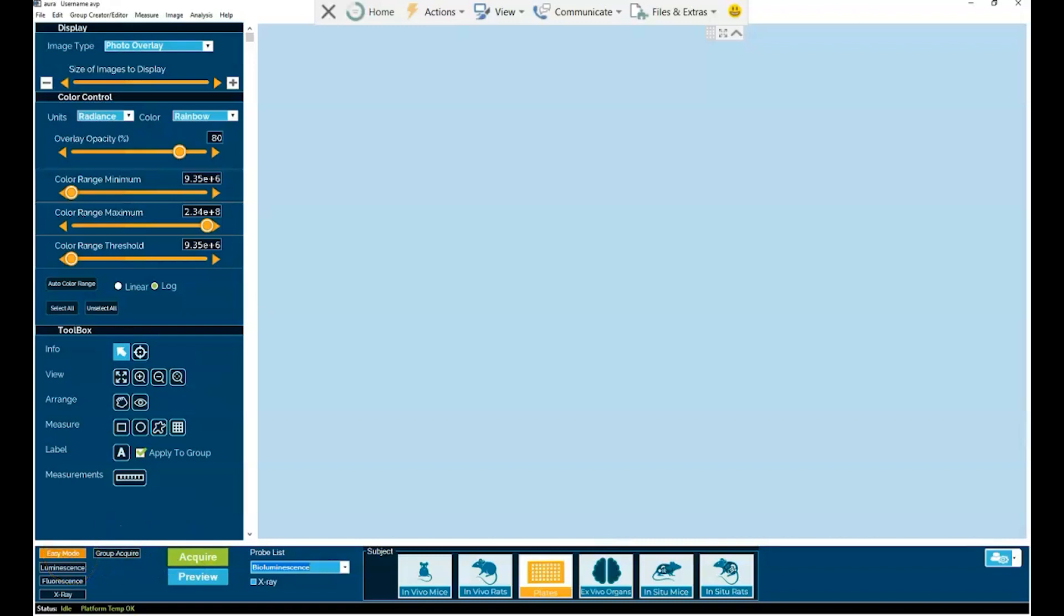Now secondly, there is smart auto exposure. And as the name of this feature would indicate, it really does two things. It drives the automation of the image acquisition process in easy mode. It is literally the heart of the easy mode feature.